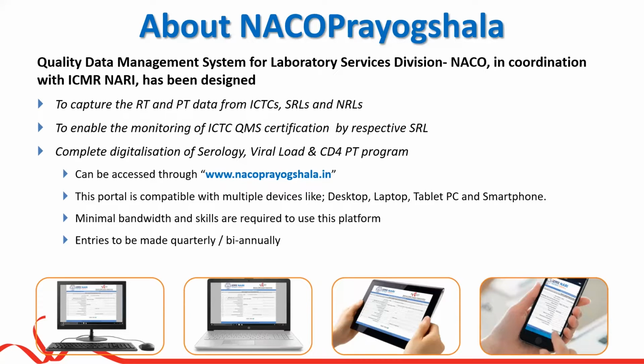Whenever any activity is going on in any cadre, entries can be made immediately, and the data will be available for review to the higher tier laboratories, and the reports can be fast tracked for the participating laboratories. So these are some of the features of the NACO-Prayogshala.